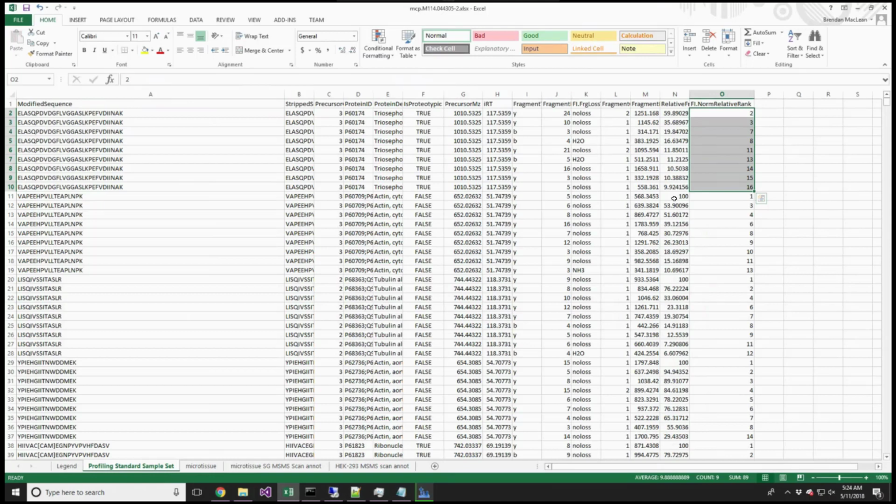I think they're normalizing to the most intense peak in the spectrum, and they're giving that 100, and then they only choose peaks in the spectrum that match the targeted peptide. So this came from a spectrum where the most intense peak is an unidentified peak, right? Yeah, something like that. Yeah, exactly.